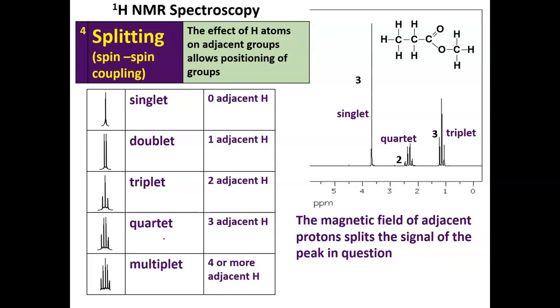And if we go beyond 4 peaks, you could use the old names, which are a pentet for 5 or a sextet for 6, but we now use the catch-all term, if you like, multiplet, which is for 4 peaks or 5 peaks or more. Okay, so as you can see, there are 5 peaks in this bundle, and those are in actually a 1 to 4 to 6 to 4 to 1 ratio.